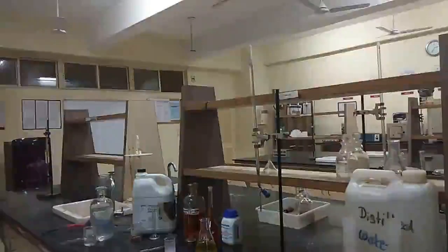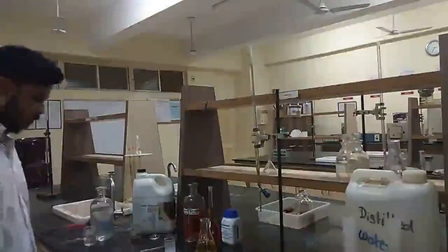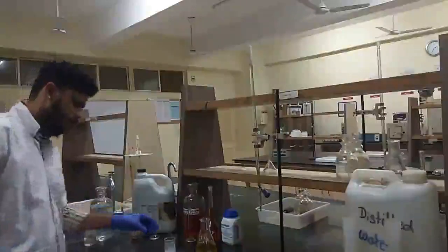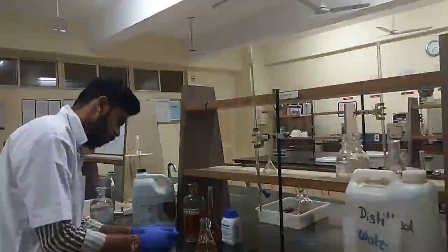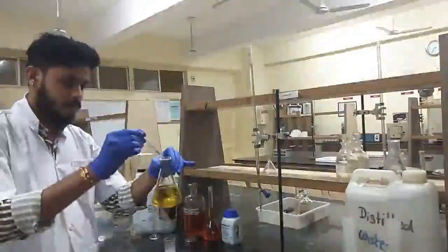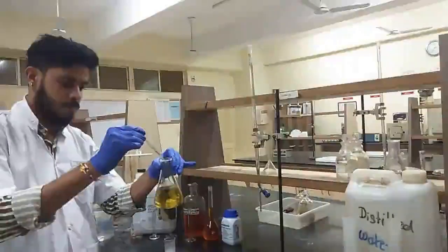Yeah, we have done with the 5 minutes, and now what we'll be doing is we are going to add the starch indicator into it. The starch indicator should be freshly prepared, and we are going to add 1 to 2 ml, which is equivalent to 4 to 5 drops by the dropper.